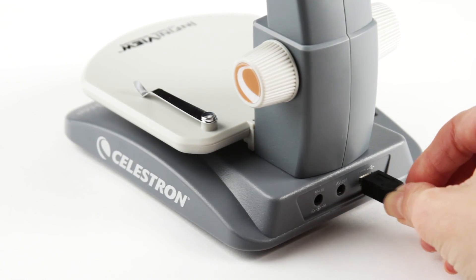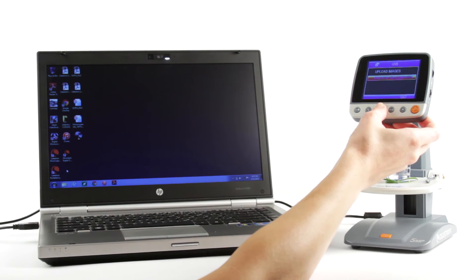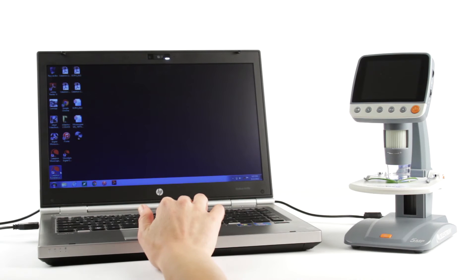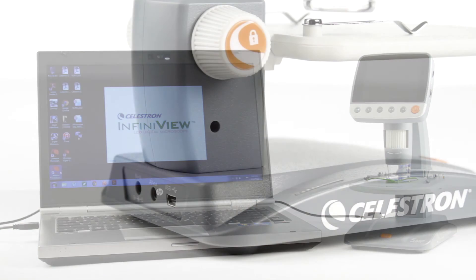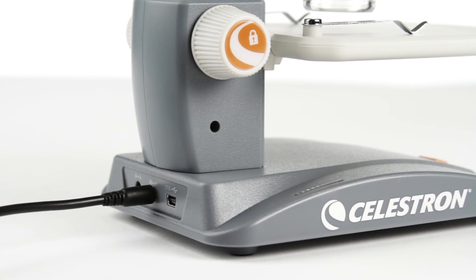Get even more features when you connect the microscope to your Mac or Windows PC via USB 2.0. You'll be able to measure specimens, save images directly to your hard drive, and more. InfiniVue also connects to projectors for sharing the view with an entire classroom.